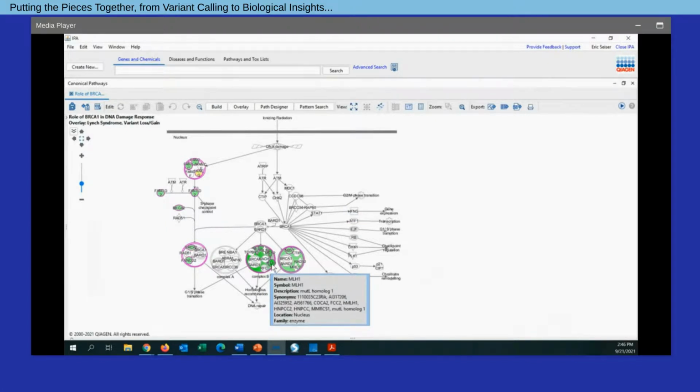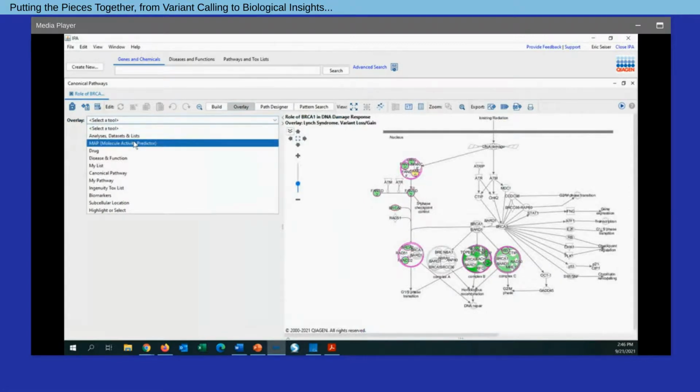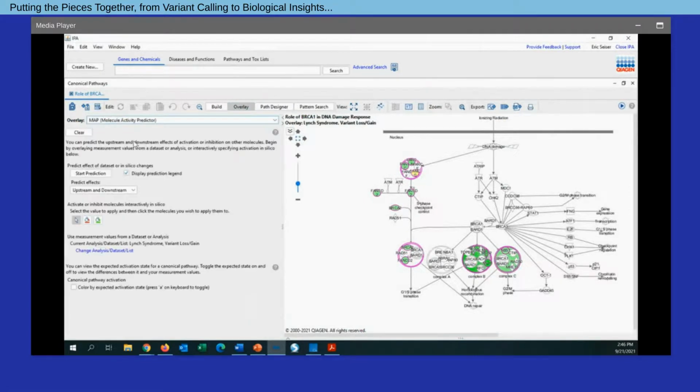And we can actually do predictions based on these observed loss of functions very simply by going to Overlay, selecting the tool, Molecule Activity Predictor. And what we're going to do here is utilize this observed loss of function and what we know from the literature and the directionality of the interactions with these loss of function variants with other molecules in the network to actually predict what we would expect the activity of other molecules in this network to be.